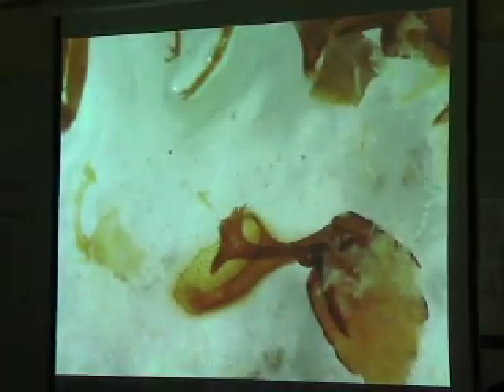I usually like to focus on the left side. This is now the left paramere, inside there the left volsella. Here's an internal, easier view of the left volsella behind the paramere. I'm doing this all by myself — I see the left-right, left-right orientation in my monitors. Here's the mediator itself, now with the aedeagus. I'm just trying to turn around, so this is the medial view, right view, and here's that desired left lateral view.